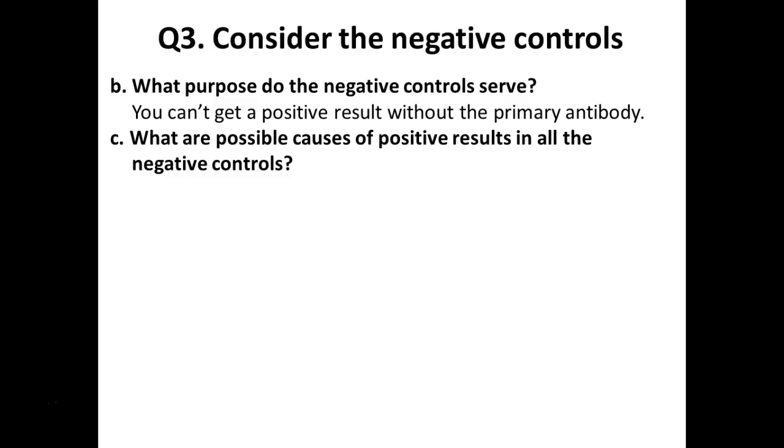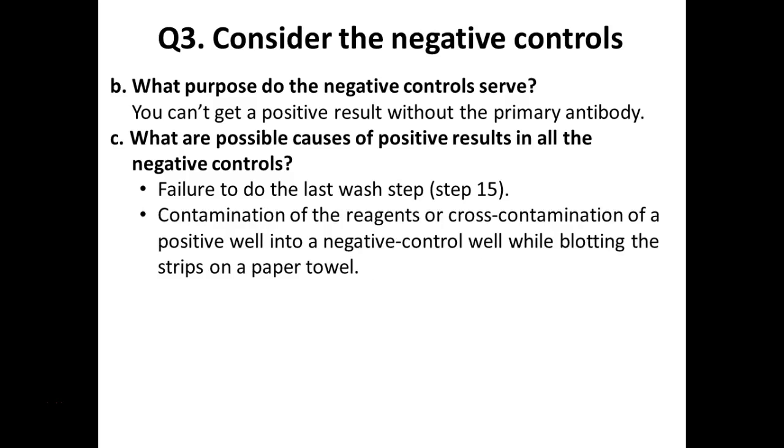Is this good? No, some type of contamination, something went wrong, right? Failure to do a wash step, right? If you don't wash them out, that might be the problem. You might have cross-contaminated, and this is why it's important when I show you guys how to wash that you do it the right way so you don't contaminate your wells, one to the other.